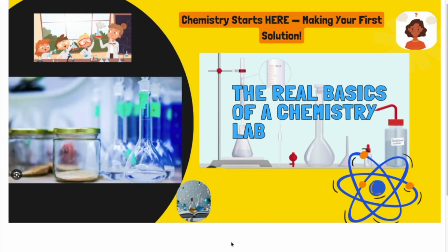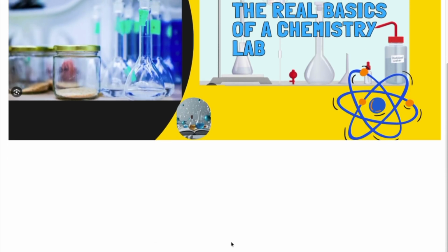Okay, so I'll start with a simple question. This is something we do ask normally in labs. Let's say in your lab somebody asks you to prepare N/40 solution of NaOH, a very commonly prepared solution, right?